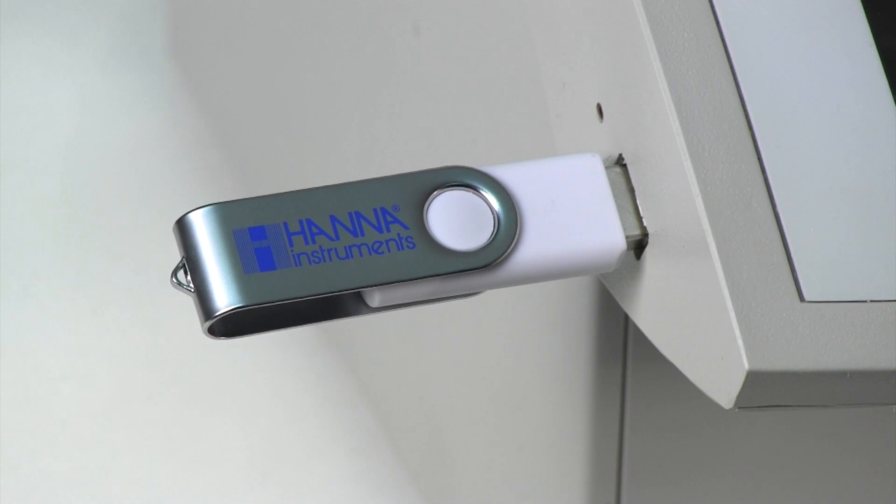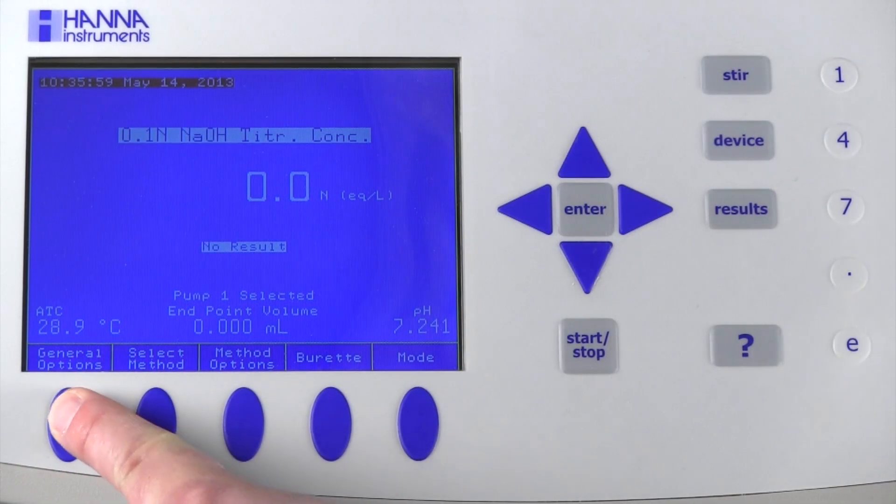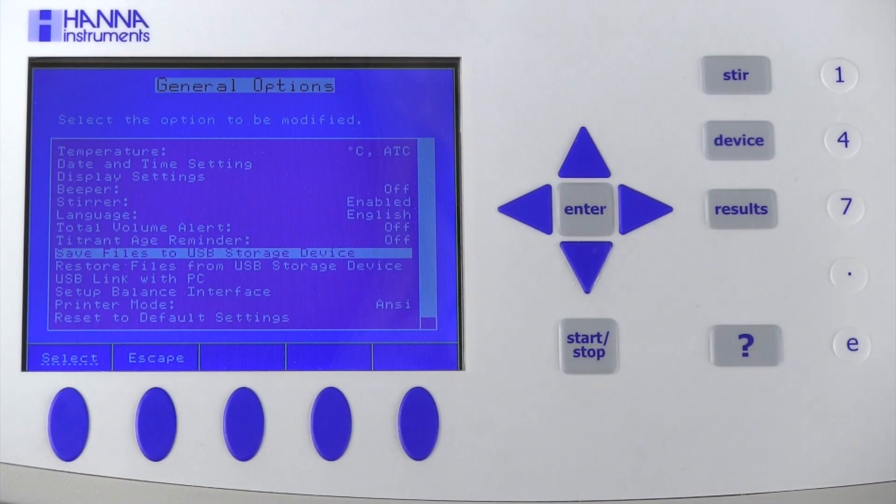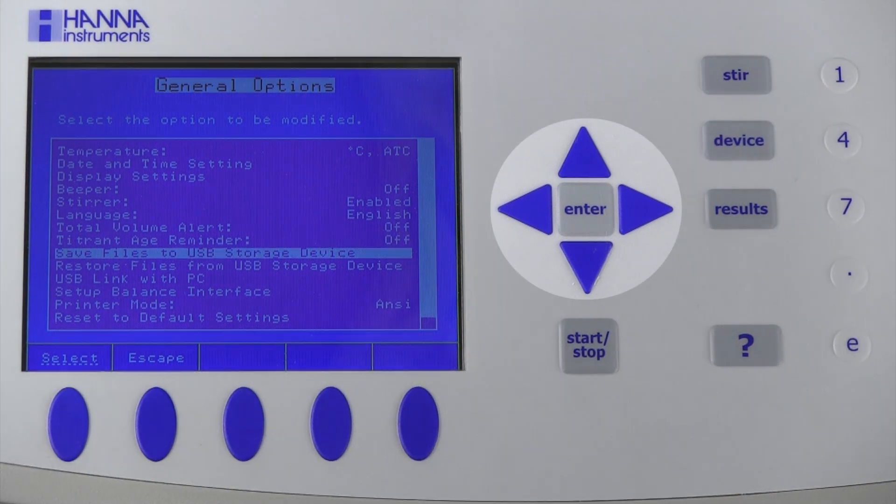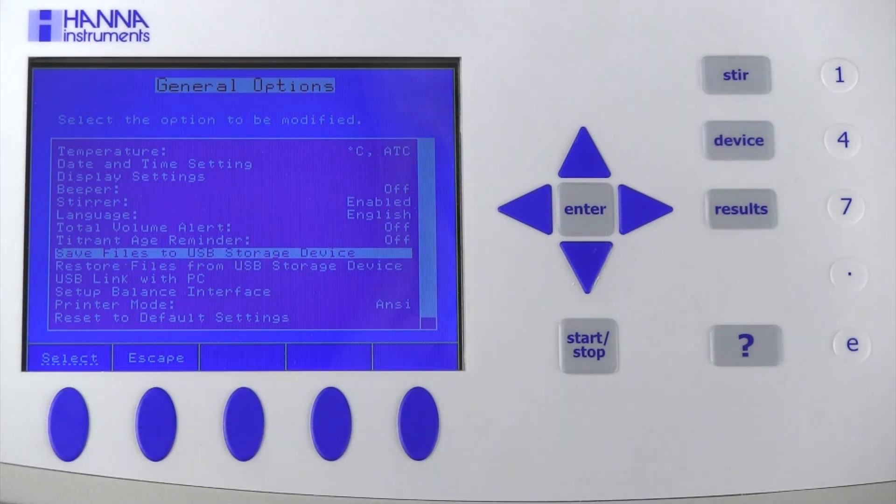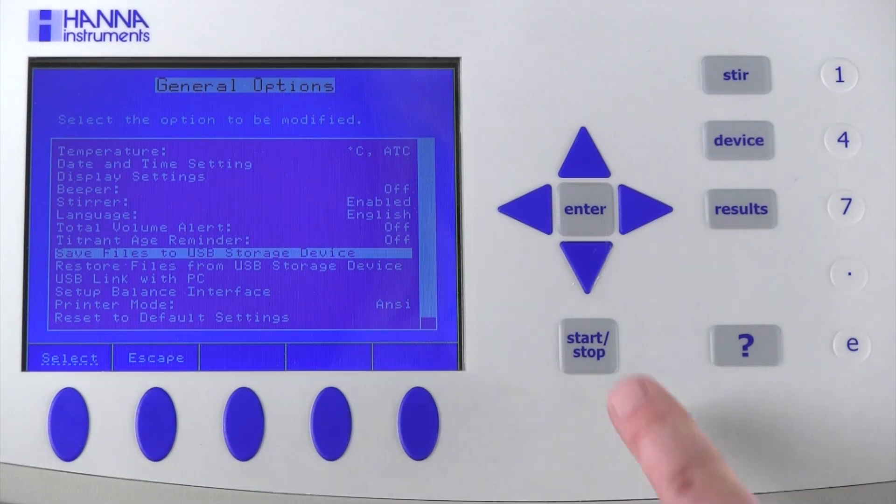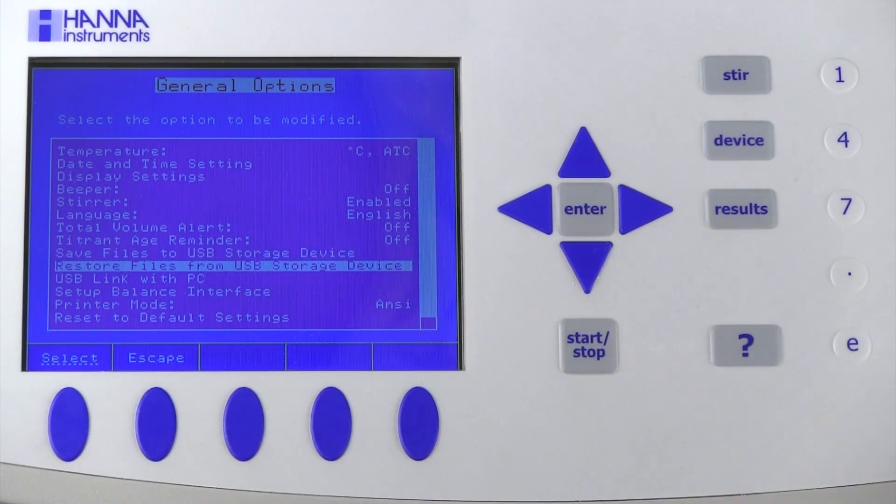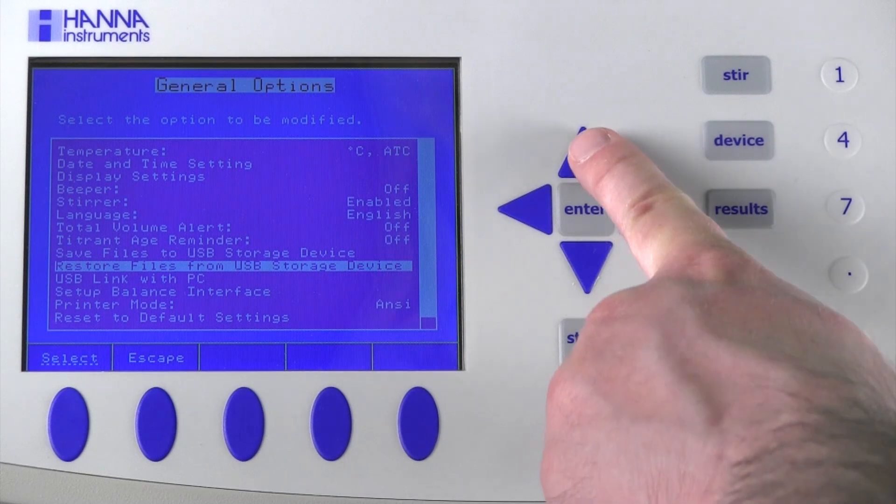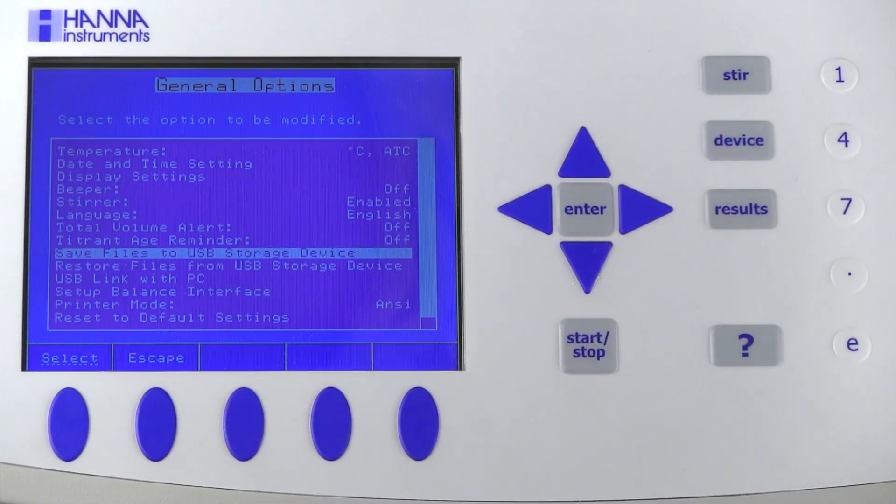Connect the USB device to the side of the titrator. Select General Options. Use the arrow keys to scroll down and select Save Files to USB Storage Device to transfer files from the titrator to the device, or select Restore Files from USB Storage Device to transfer files from the device to the titrator.